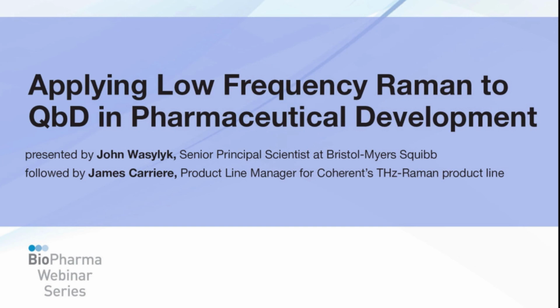Yeah, I think the problem goes back to what John mentioned earlier: access to this low-frequency portion of the spectrum was so difficult for so long that people didn't really work with it. So the understanding of exactly how all the differences are changed is really the new frontier of Raman spectroscopy that we're developing here. It's just an exciting field of research for everyone involved.